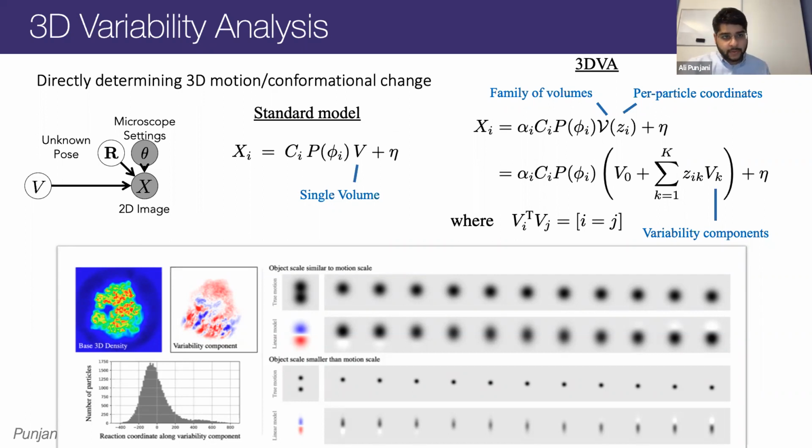But in order to figure out which parts of the protein move together and which parts move separately, 3D variability analysis gives you all that information without knowing that ahead of time. Okay. Last question, I think, before we can move on to examining the results of our experiment.